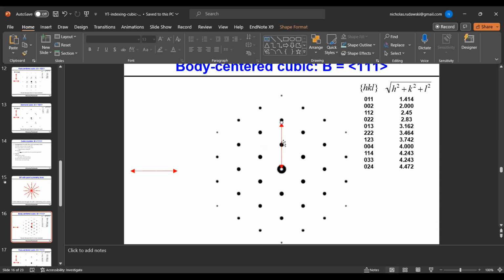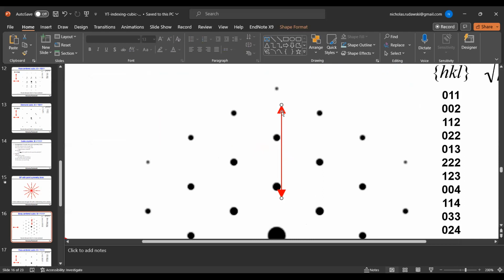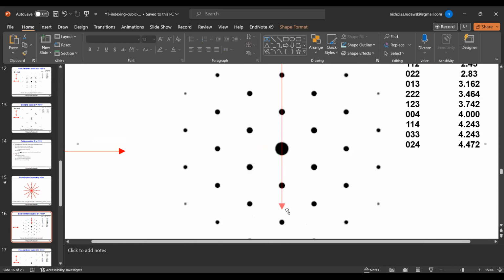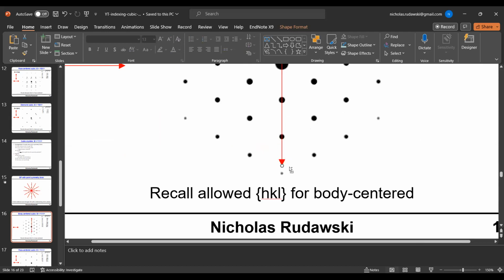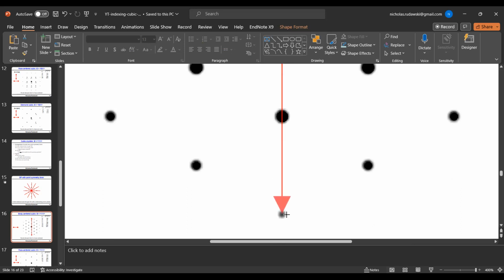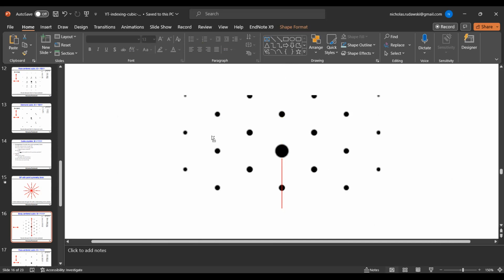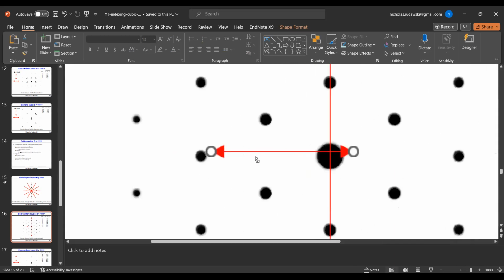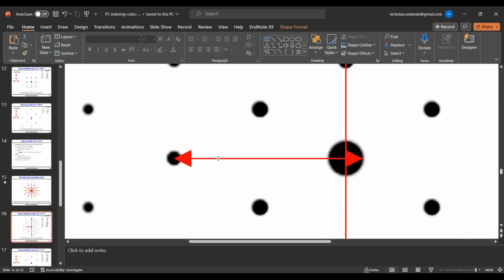So again, there's 6 increments there. So let's measure 6 increments. So I'll put my arrow starting there. Let me scroll down. Okay, right there. Okay, and now I only have 2 here that I can use for G2, so we'll have to make do with that.